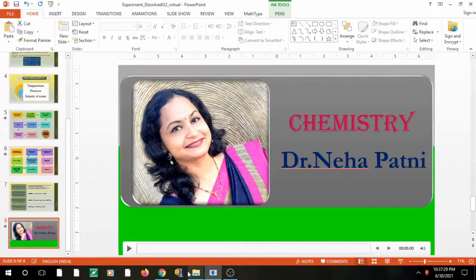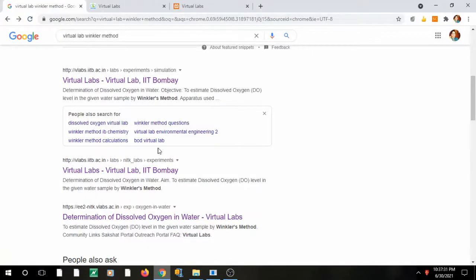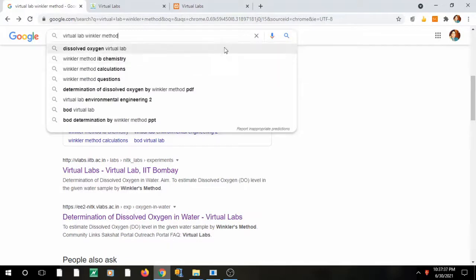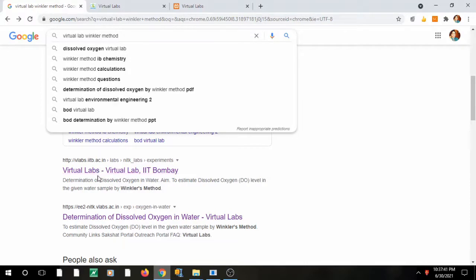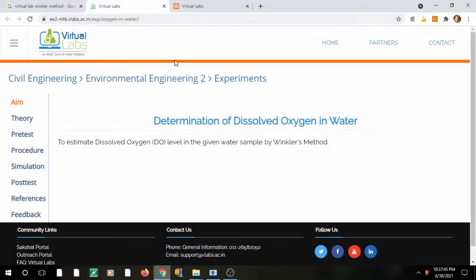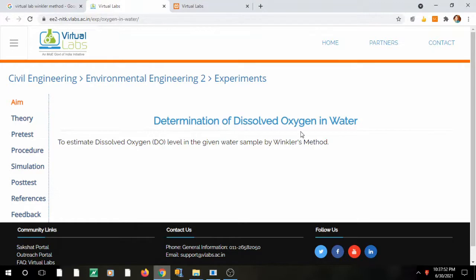For the virtual lab, type 'virtual lab Winkler method' in the search column. You will get links — either IITB or NITK — and clicking either will take you to the same page. This is a government of India initiative for virtual labs. Here you can see 'Determination of Dissolved Oxygen in Water.'